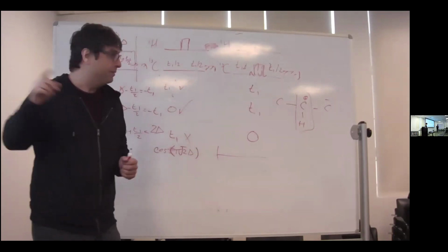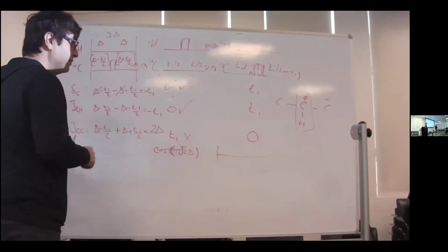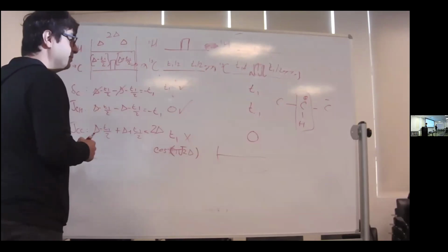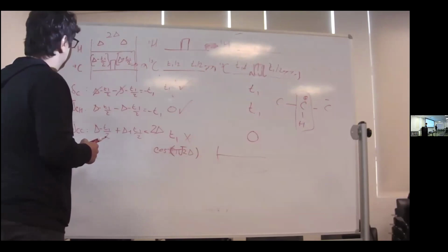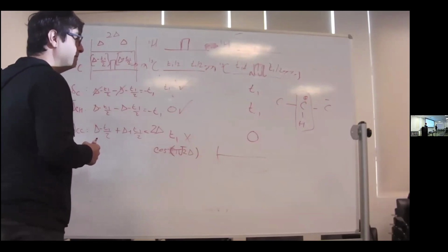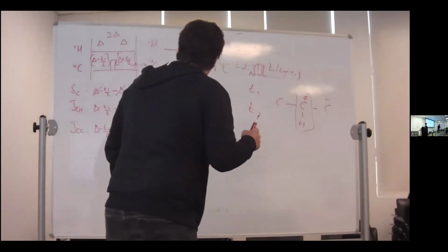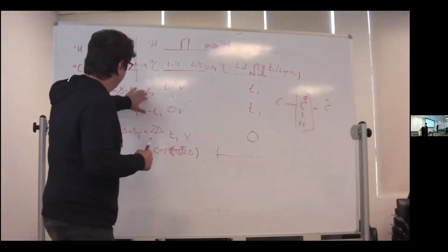So let's walk through what this sequence does. So when I'm shifting the pulse, if my delta is greater than T1, so for a certain period of time, it is not refocused. It's all right. It's not refocused. Well, it will evolve exactly like this.